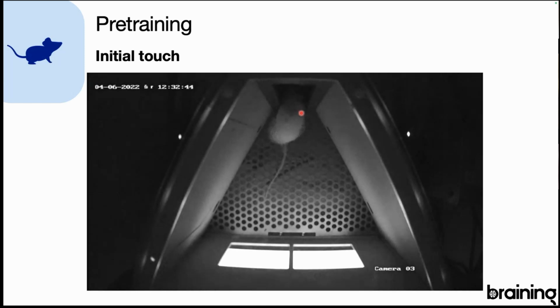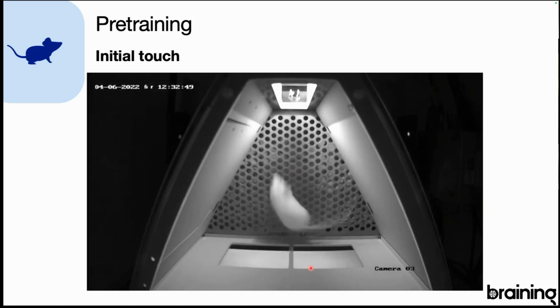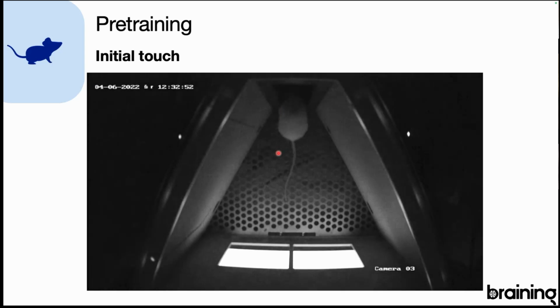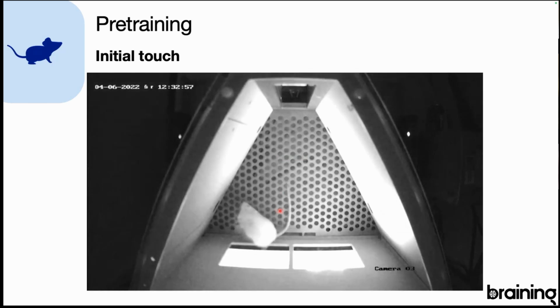It's really a big food gain for them. Between the trials, after the animal selects the image and gets the reward, we have a trial interval, which in the case of mice lasts 5 seconds. Imagine the situation, which is not demonstrated in this video, that the mouse doesn't touch the image within 30 seconds. The image disappears, but the mouse still gets a smaller reward, signalized by the magazine light. The reward is only 1/3 of the normal amount given for correct touches.